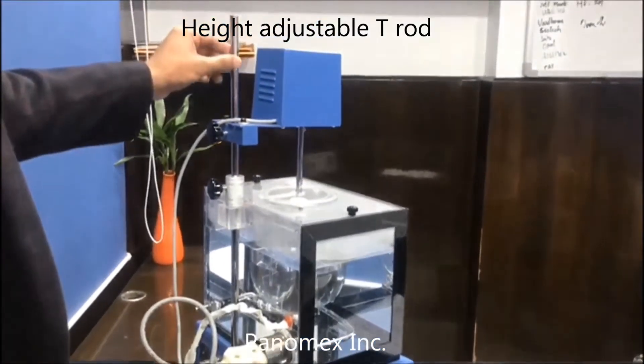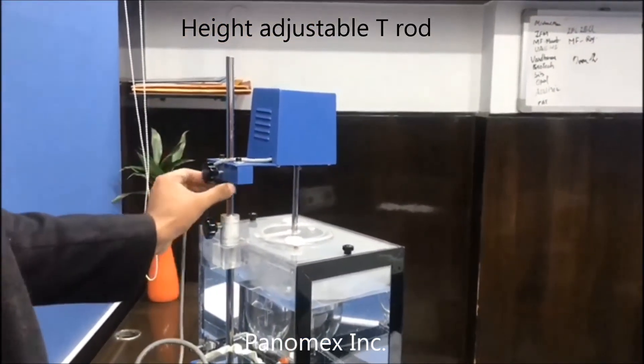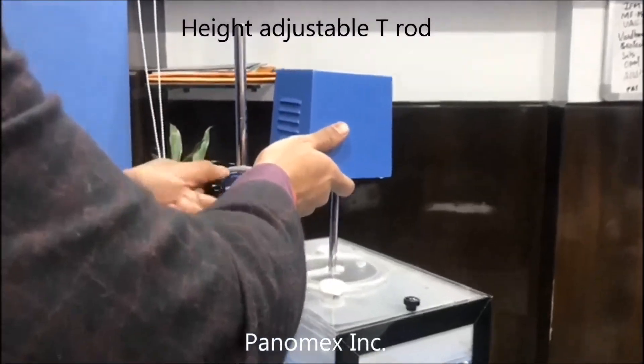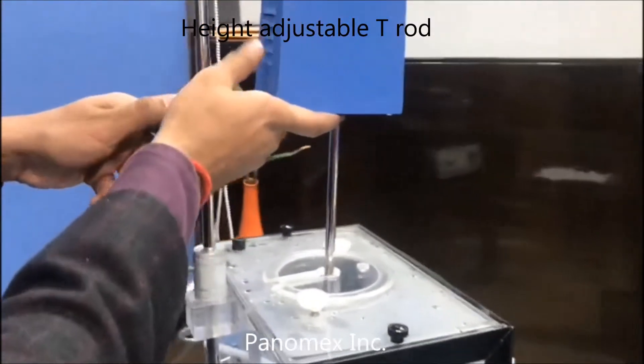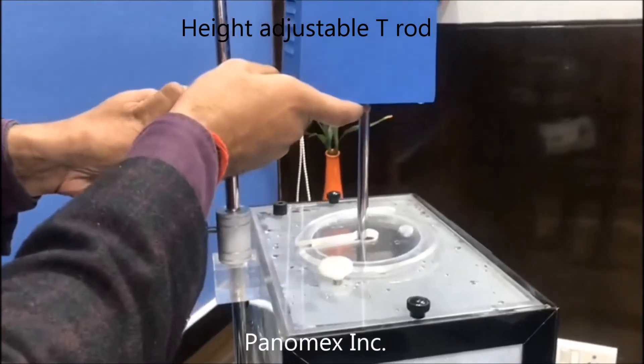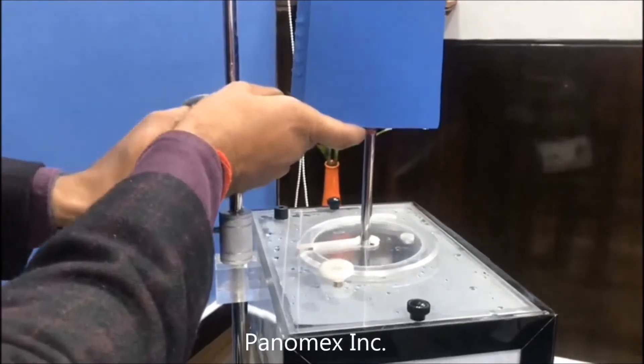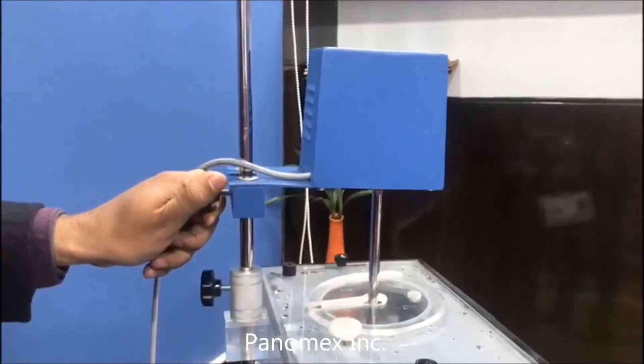This is the T rod. You can adjust it like this. As you can see, when you are adjusting it, the stirring machine is moving, which you can adjust as per your need and requirement.